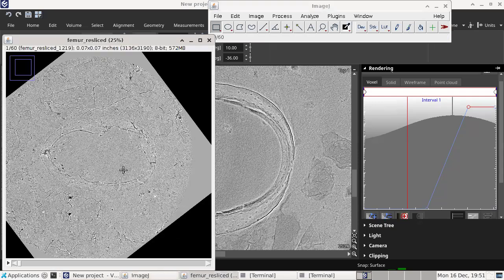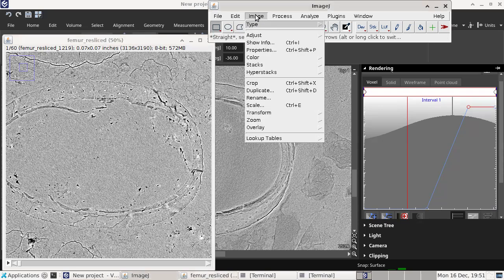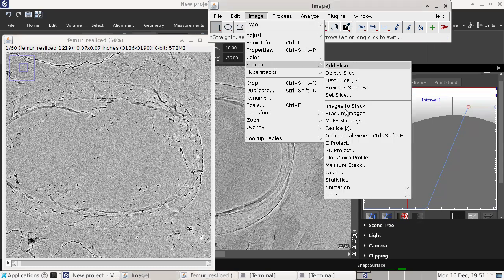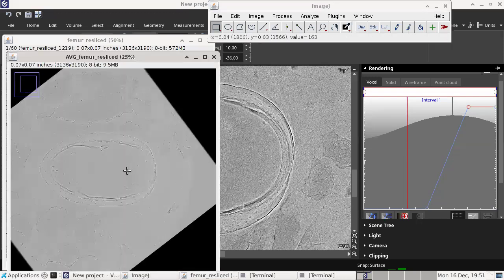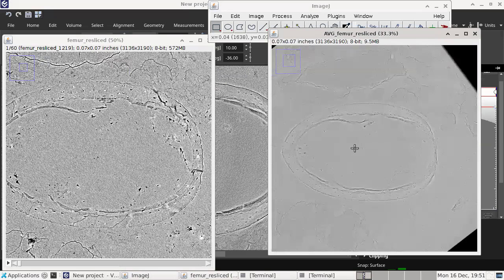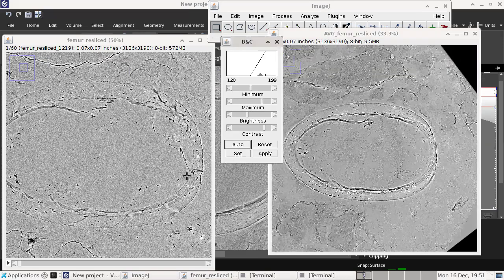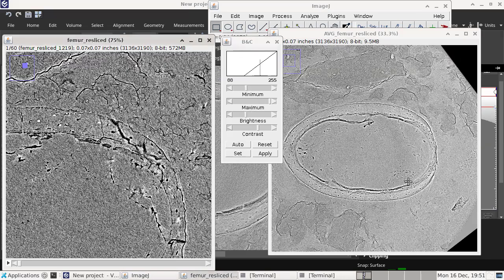Right. So we have this. It's the same as before, with no Fix Lab enable here. And we go to Image Stack, Z Project, average, and now we get a single image again. And if we adjust the contrast, well, it's the same as before.